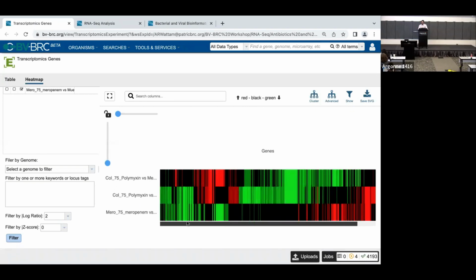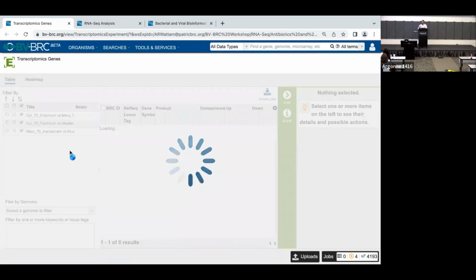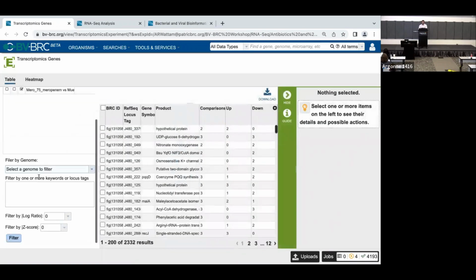And regarding your question earlier, if you are interested in looking only at genes such as transporters or virulence factors, you can enter the names of those genes, keywords, or a list of identifiers in the text box where it says locus tags or keyword. Let's apply those keywords and have only those show up in the heat map. Define your keywords.